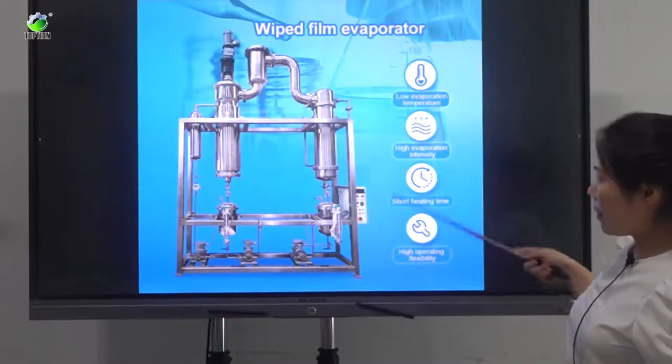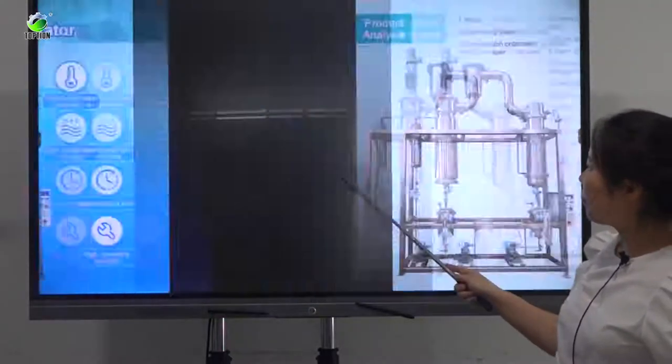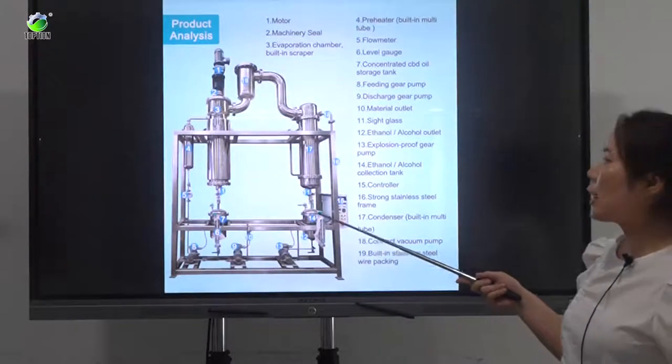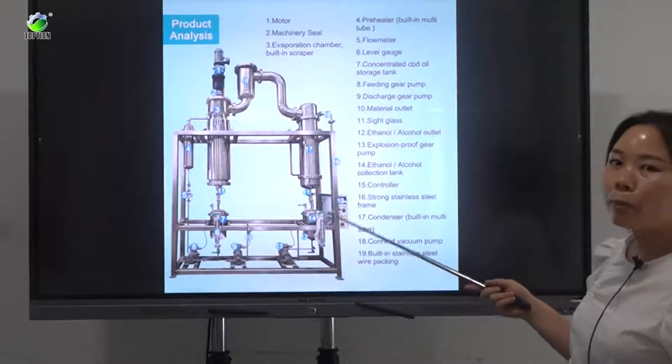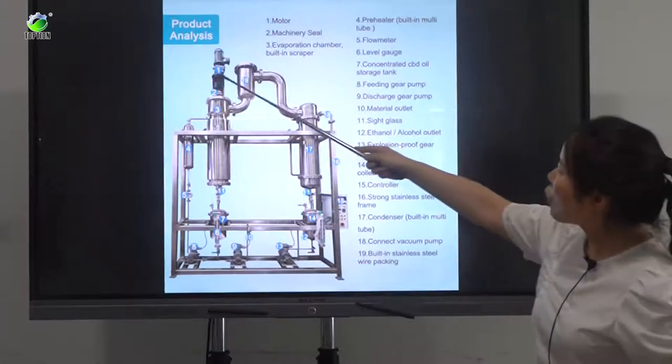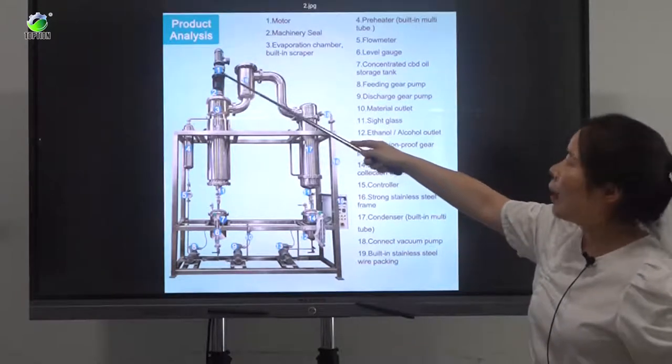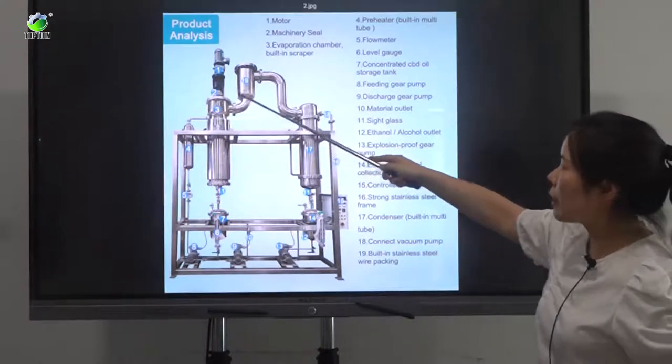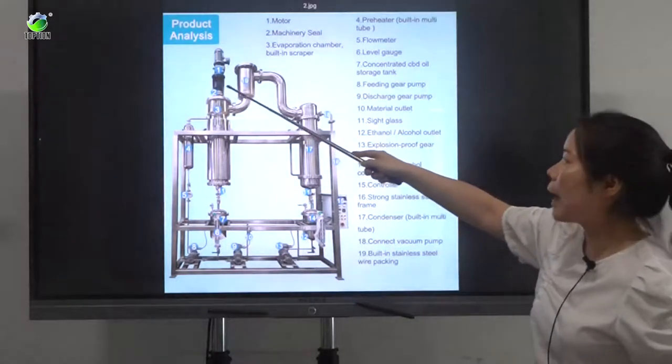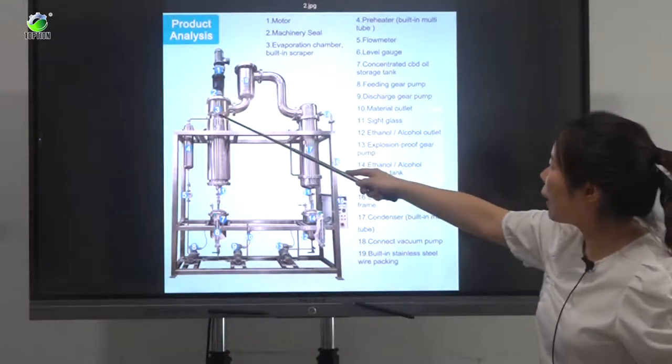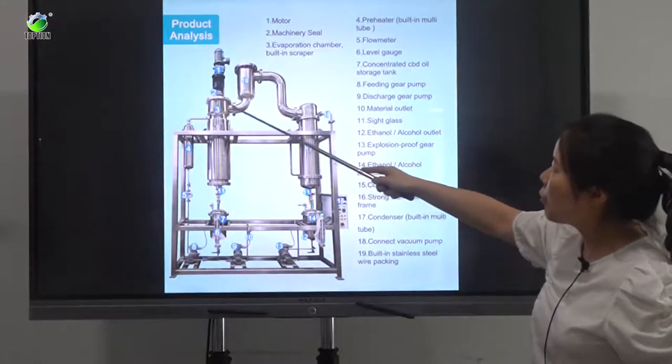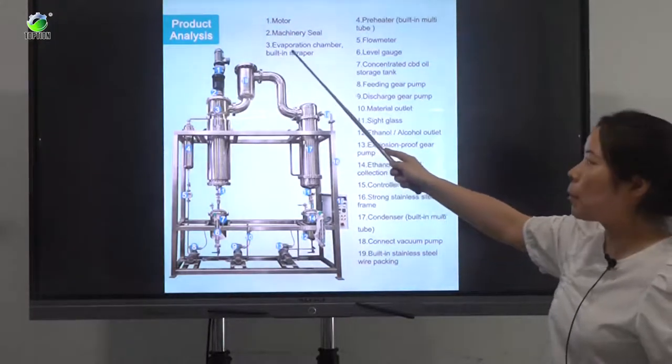This is the structure. Here we can see the structure of this wiped film evaporator. The first one is the motor, and second is machinery seal here. This is machinery seal with high vacuum. The third one here is evaporation chamber with a built-in scraper.